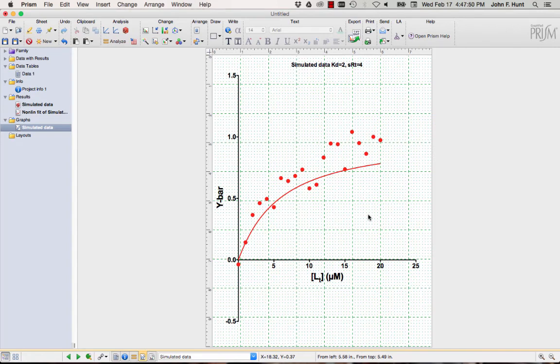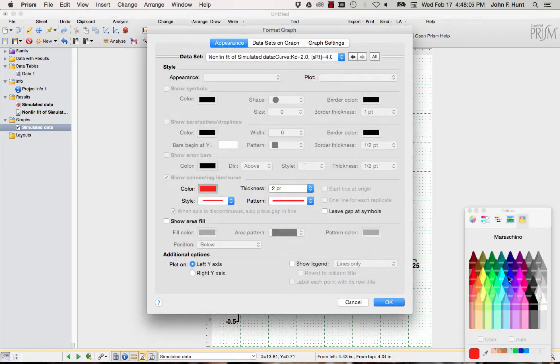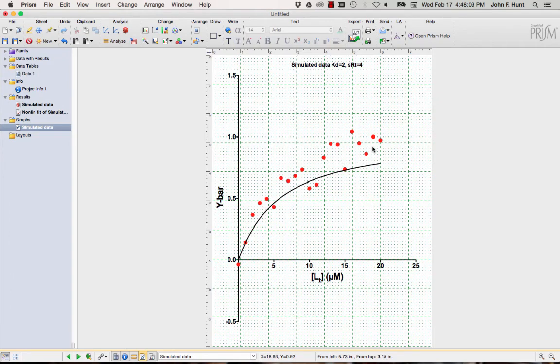Again, this stuff will be explained in some detail in Module 2 of W4082. We could be way further off than this and it would still likely converge. But anyway, this is a nice sanity check, because we can see that our initial parameter estimates are close to the data. Now we're going to actually fit the data, and we're going to see that the parameters move around. So let's go back to that.